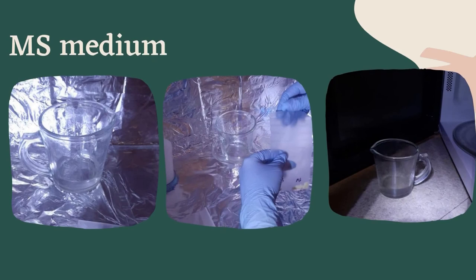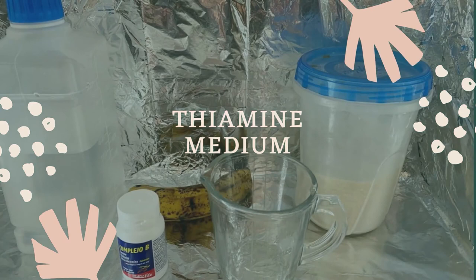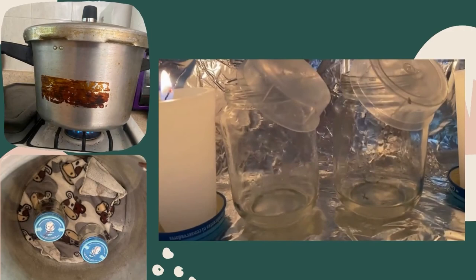For this, the MS medium was diluted in 50 milliliters of distilled water. Then the agar was added and heated in the microwave for a few seconds until the agar was completely diluted. For the homemade medium, 50 grams of a banana were liquefied with a thiamine tablet and distilled water. Gelatin was added and heated in the microwave to dilute it. I sterilized the flasks using the express pot for 40 minutes, and then I added the medium.